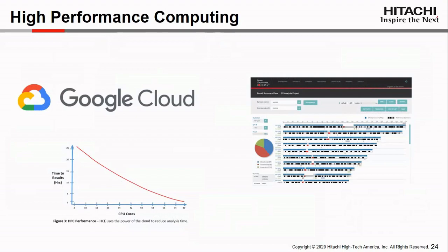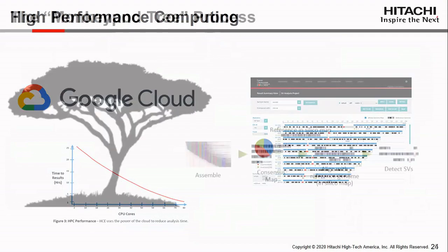The results are high-quality de novo assemblies and accurate SV calls in dramatically shorter timelines, and without the introduction of compression, which could result in data loss. No discussion of cloud applications can exclude security. HCE is hosted in a highly secure environment we call the LIC security framework. This framework consists of a web application firewall on top of Google Cloud's advanced security features. Lastly, our partnership with Google Cloud allows us to deliver all the value described in a cost-effective service.